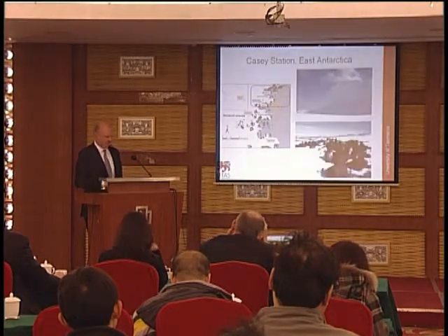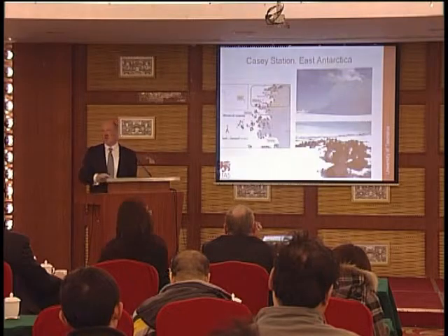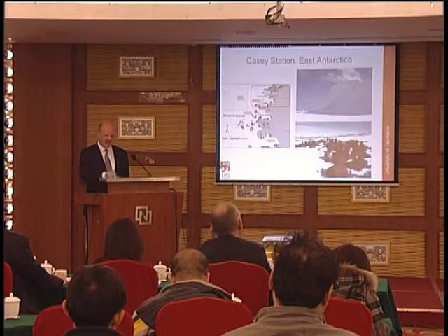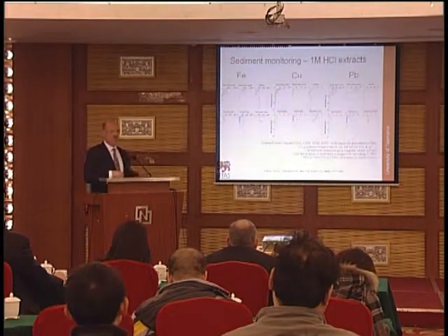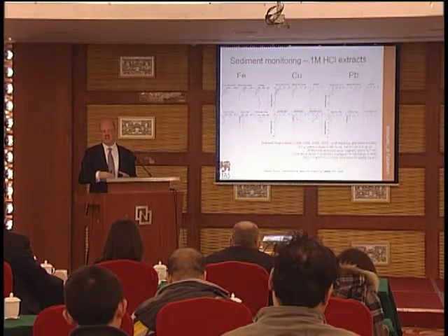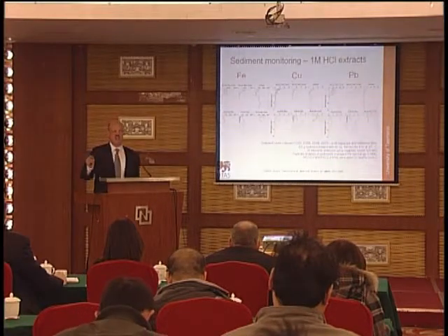So we take away the map, and yes, Antarctica looks like this, and it's beautiful, but you'll also see adjacent to the coast waste disposal sites where rubbish is just simply dumped, and that's no longer acceptable. So we've been taking marine cores under very difficult conditions off the coast of their stations, and we've been using a very dilute acid, 1 molar HCl extraction, to try and simply extract the anthropogenic, or the contamination, from the geogenic base material.